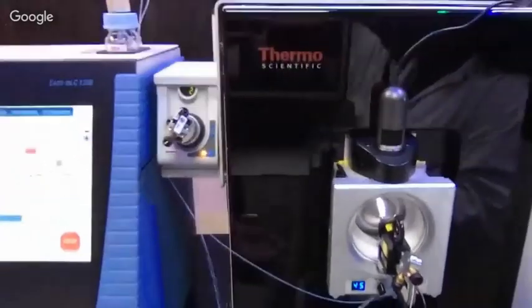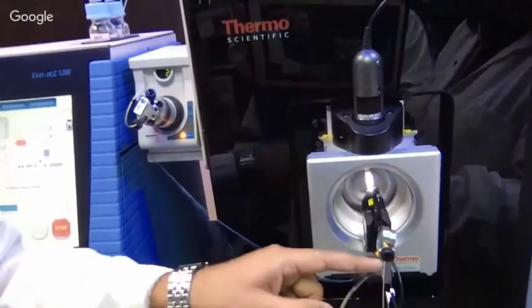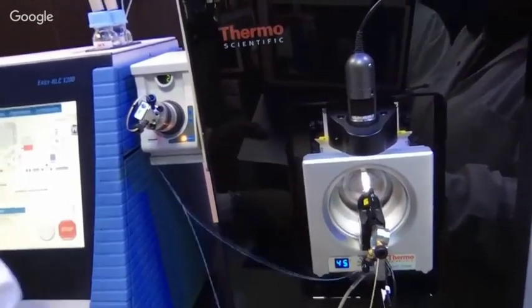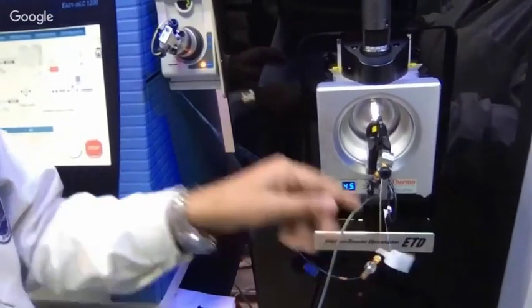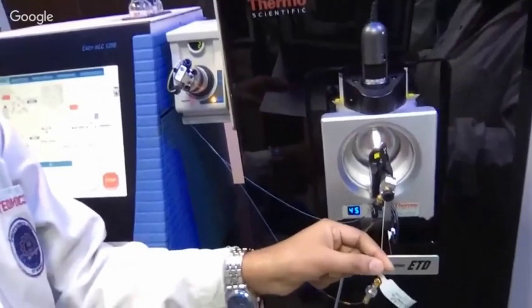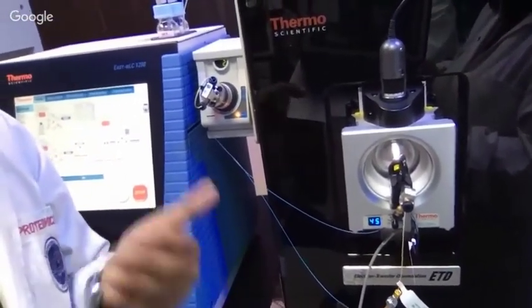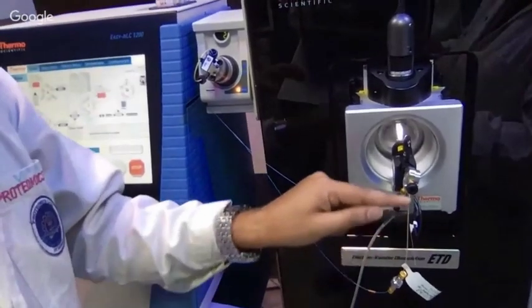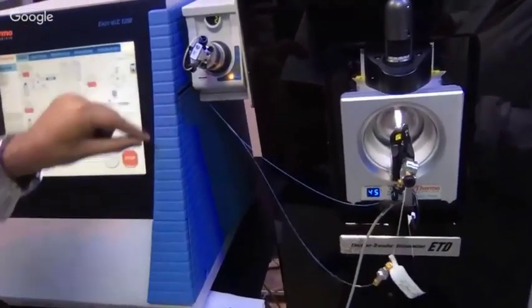Now here you can see these tubes. This one tube is coming through the nano LC, and then it will go through this. This is one column. Here you can see there are two columns: one is this pre-column and the second is the analytical column. The main function of the pre-column is to desalt and clean your sample. If there is anything contaminated, it will go from here into the waste. You can see this tube, which will go into waste.